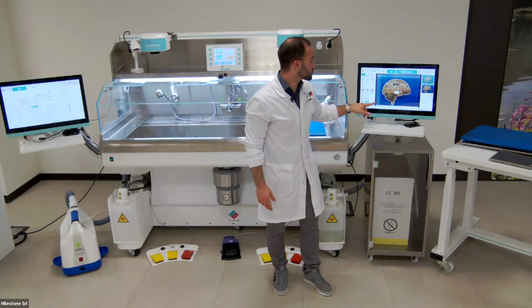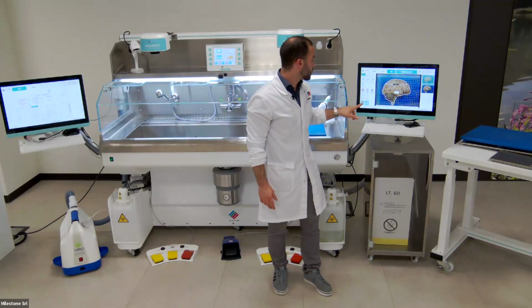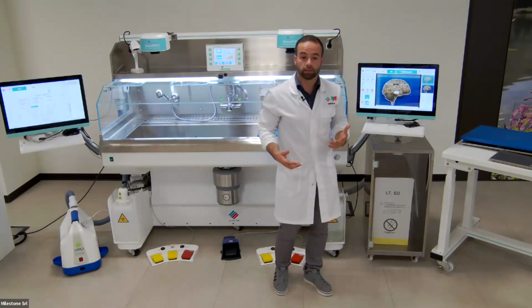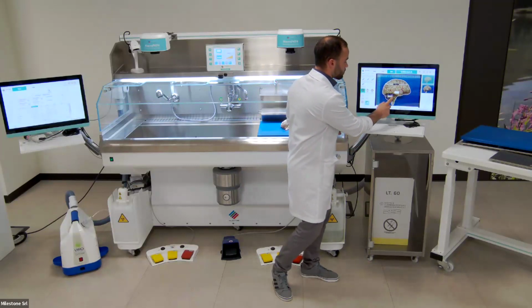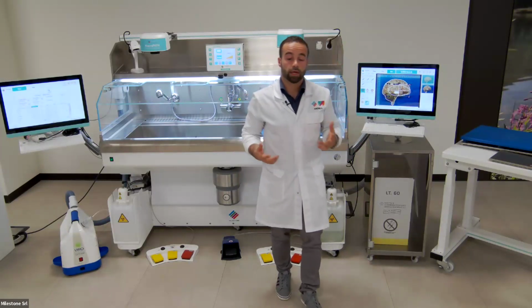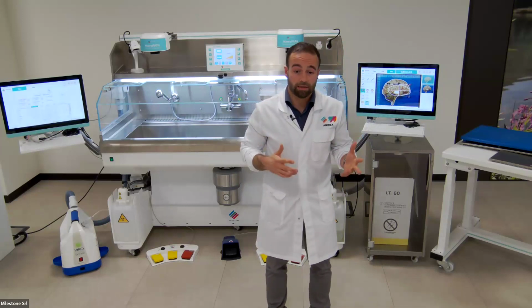For example, it's possible to add the ruler or the grid, or, for example, divide into quadrants. For instance, we can divide this part into quadrants. So there's a lot of possibility of customization and editing.